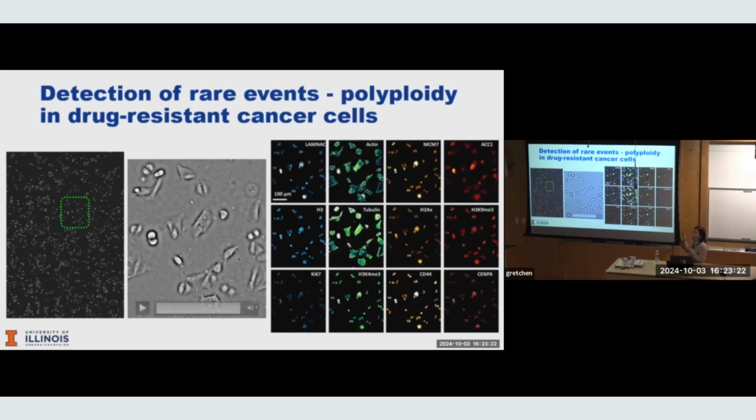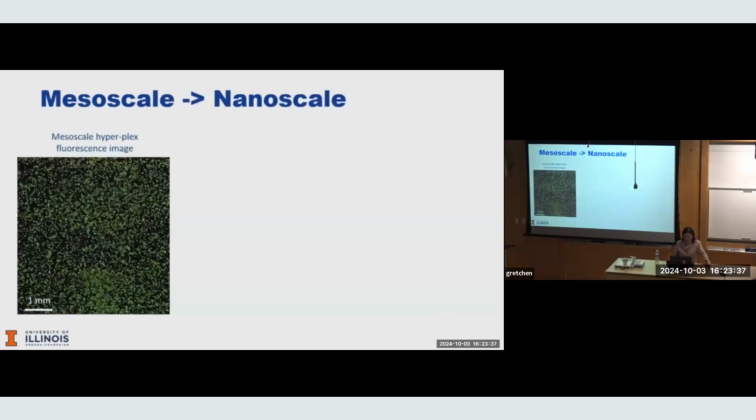So they capture lots of the molecular characteristics that help us interpret those dynamic changes, so that you get the full picture of what is happening underneath those morphological changes. To further link the fluorescence microscopy, as I said, this mesoscale gets down to 700 nanometers, but not really super resolution. So to cross that scale, we actually use image registration.